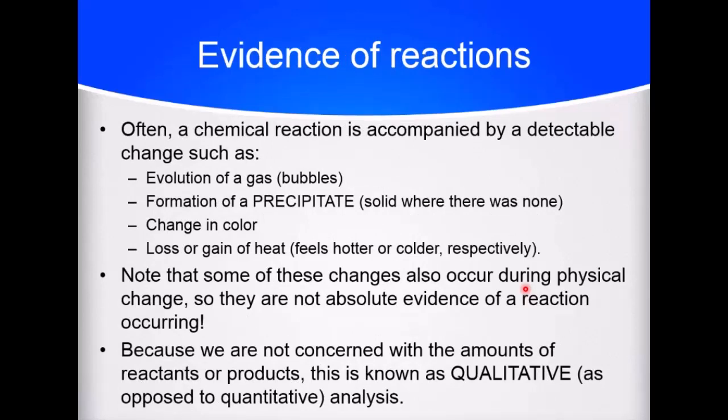Evidence of reactions can be in a variety of different forms, some of which indicate a chemical reaction, but some of which could also indicate a physical change. Presence of bubbles could be something boiling, or it could be a gas that is produced as a product in a reaction. Formation of a solid, generally speaking, is going to be a good evidence that a reaction has occurred, as long as there wasn't solid to begin with.